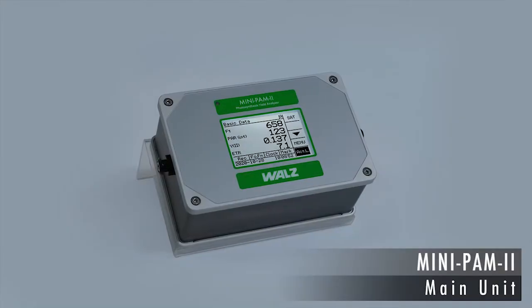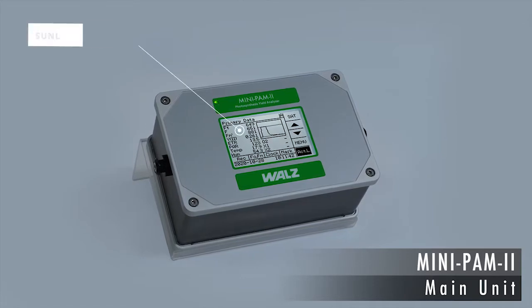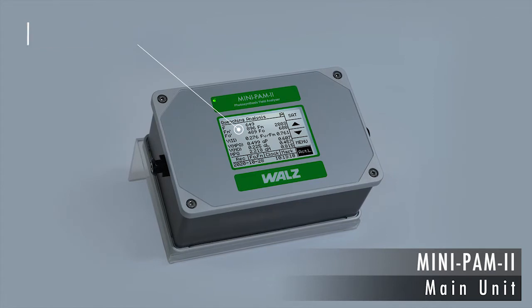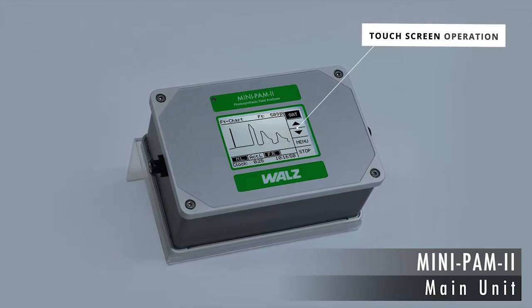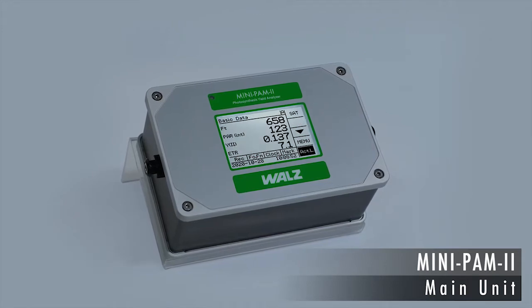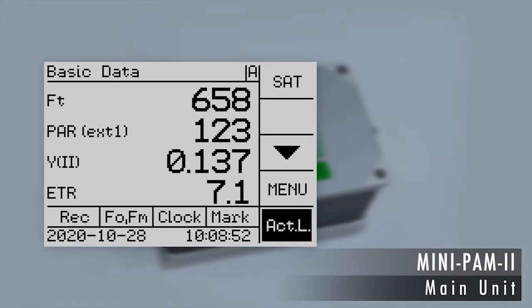All components are encased in the rugged housing of the MINI-PAM2. A sunlight-readable touchscreen serves as both an input and output device. Easy-to-use navigation keys provide quick access to the various functions of the device, with the option of displaying only the key parameters.